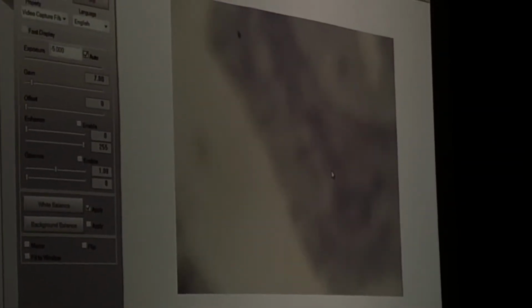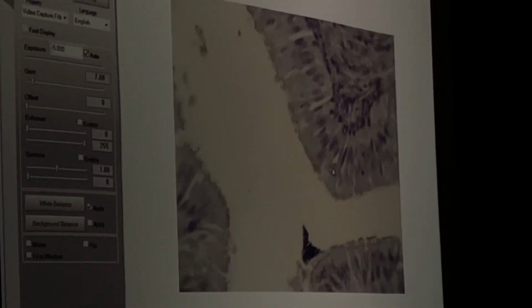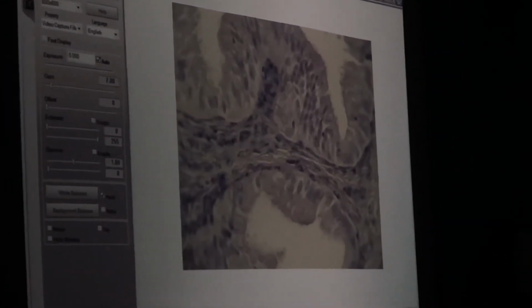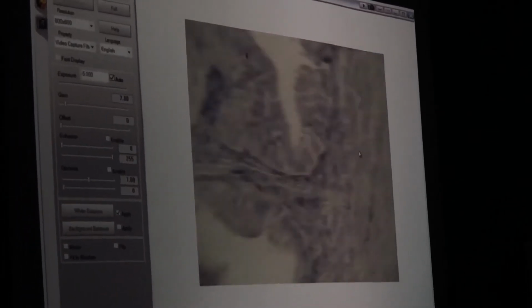Let's go up to even higher power. So what kind of epithelium am I going to see on these? Ciliated columnar. Yeah. So if I look at these, definitely can see the cilia, definitely columnar cells, right? So they look a little different. All right. And so I'm going to see nice kind of mucosa with a little lamina propria underneath that.